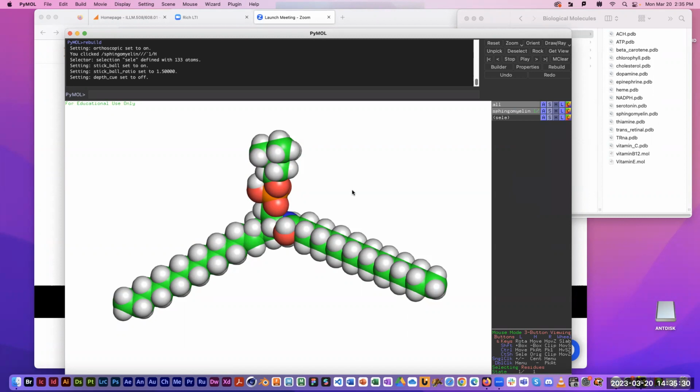One thing I don't care for about PyMol is that it automatically opens carbons as this bright green. And then if you open another molecule after it, it might open the carbons as bright yellow. And you open another molecule, it opens the carbons as bright pink. And I don't quite get that. I don't know why it chooses all these weird colors for the carbons. Why not stick with the standard dark gray from the CPK scheme? There is a way to change that.